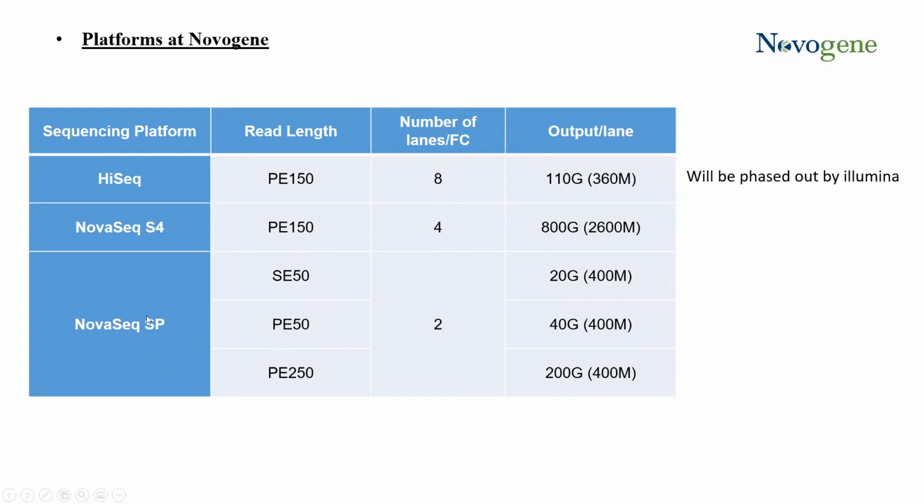The other option that we do offer on the NovaSeq 6000 is the SP lane, or SP chip, and that can be accommodated by a couple different sequencing approaches. So mind you, shorter isn't always better. It depends on your library construct. If you need only 50 base pairs, it might behoove you to get it.